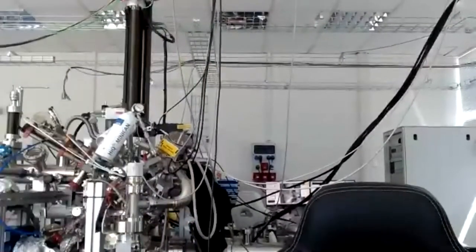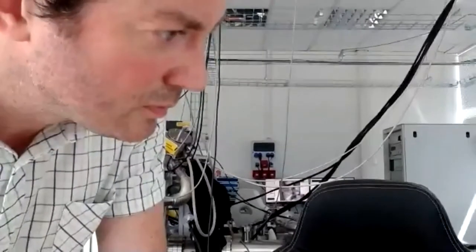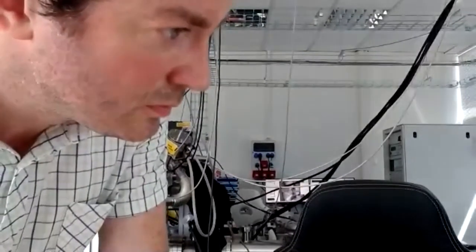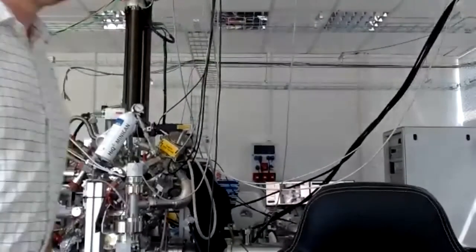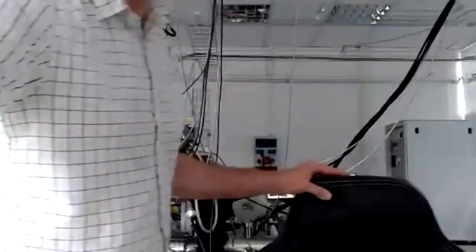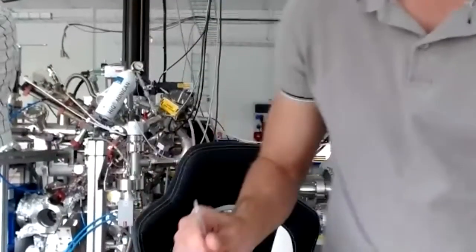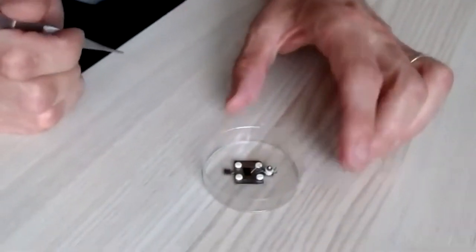We switch the camera. That's okay. So we switch to the second computer, to this measurement one. Maybe I can show you one example. This camera is on. So you see, here is the sample holder on which we mounted the sample. Maybe better to take it like this.